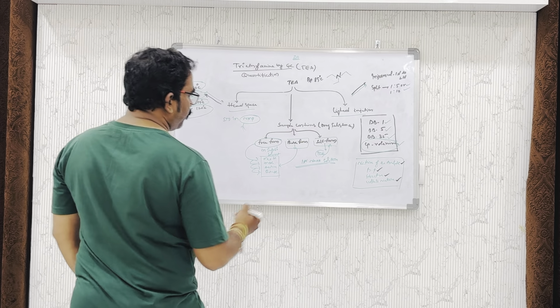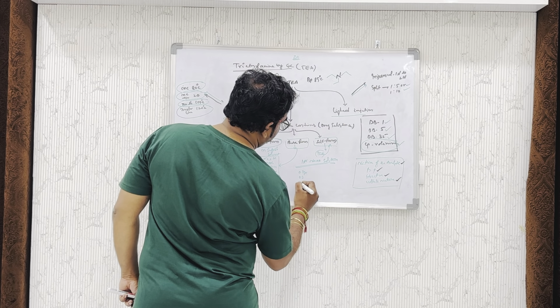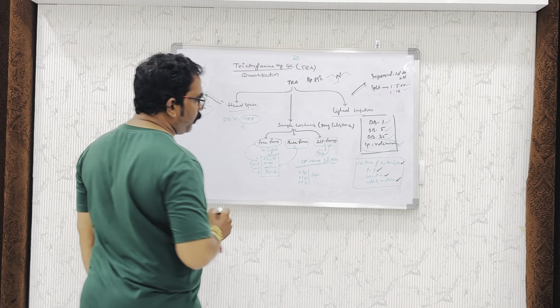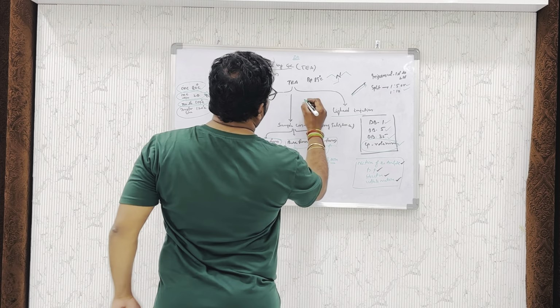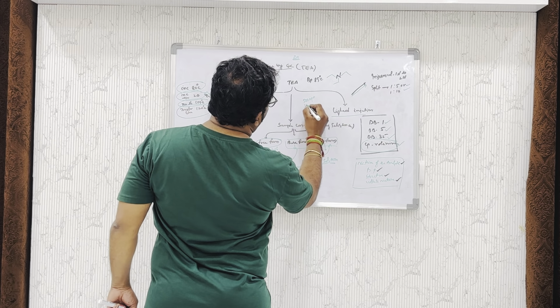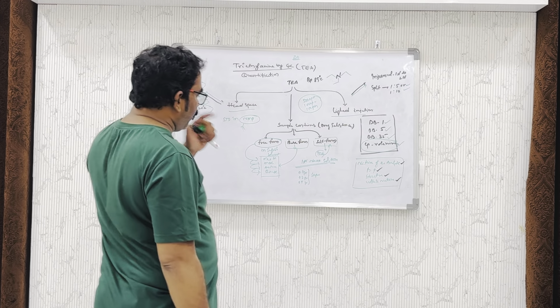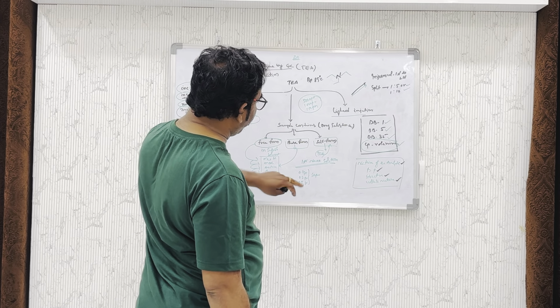For example, here you take 0.1 gram or 0.3 gram or 0.5 gram of sample. The sample weight is based on your requirement of quantification level. For example, sometimes we quantify 5000 ppm or sometimes 1000 ppm or sometimes 100 ppm. Based on the specification level, you can increase the sample concentration to 0.1 or 0.3 or 0.5.